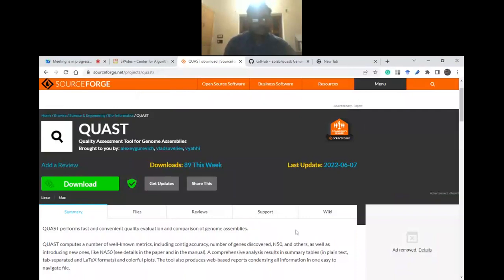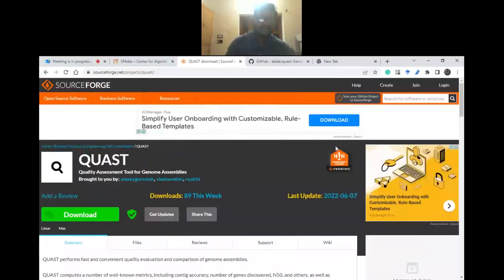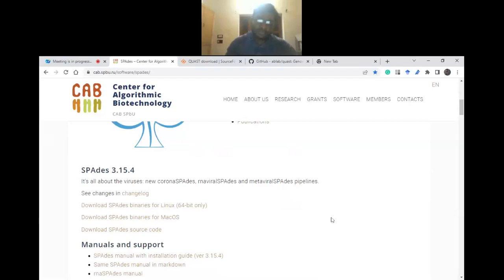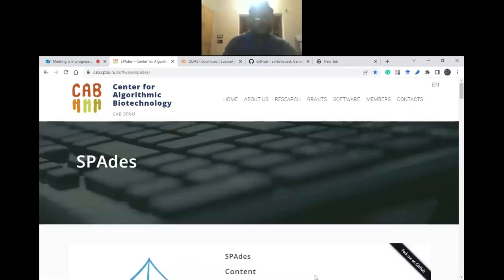So it is available from three sources. Either from the Ubuntu or Debian repository, or you can download it from the binaries directly from GitHub, and the third one is the Conda installation. So you can also use it inside the Conda environment. Okay, sir. Thank you.